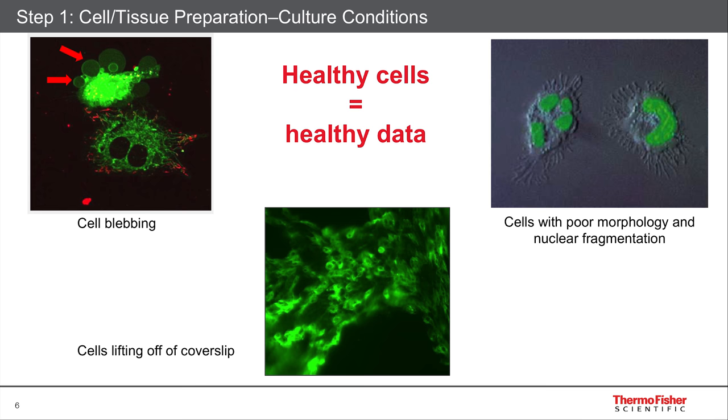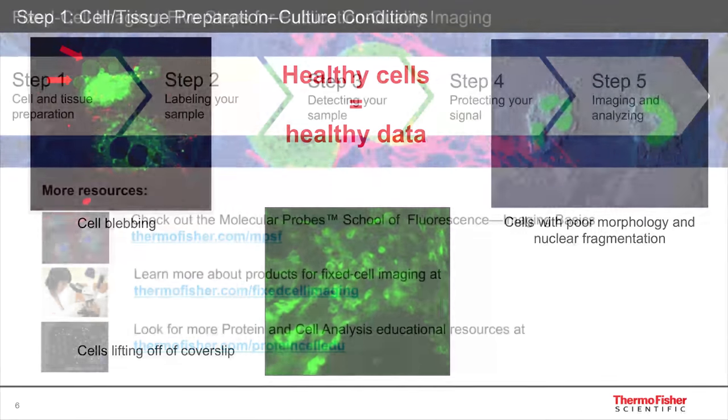This is a green nuclear dye called CYTO-13. And at the bottom, you can see an example of some fairly confluent cells that are lifting off the cover slip that they were supposed to be adhered to. This causes distortions because you can't really focus on the cells that are not well adhered in the same focal plane as the others. So for some cell types, you need polylysine or some other substrate treatment in order to allow good attachment. Healthy cells definitely make for healthy data, so have a good beginning to your process.